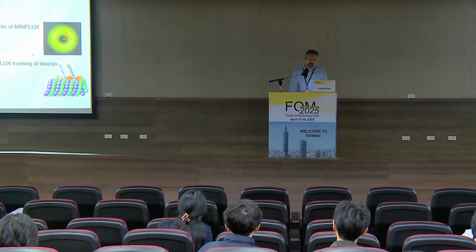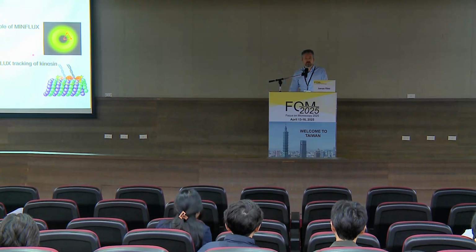And indeed, unspecific binding is a problem. I wasn't aware that DNA probes tend to bind to the membrane unspecifically. I think the first thing I would do is to not have the docking strand, but do the imaging only with the imaging strand to look at the background, if this happens and how much it happens. If it happens, maybe one could try a different dye that has a different charge on the imaging strand, which might interact differently with the lipids.